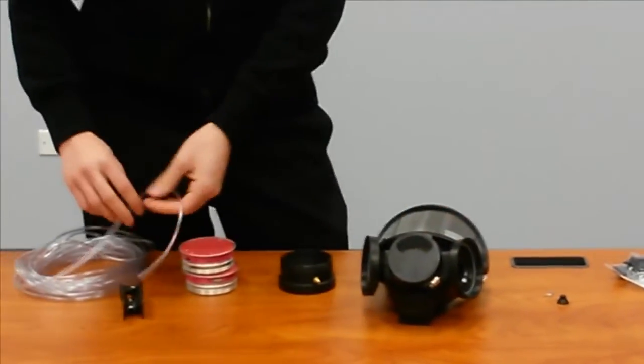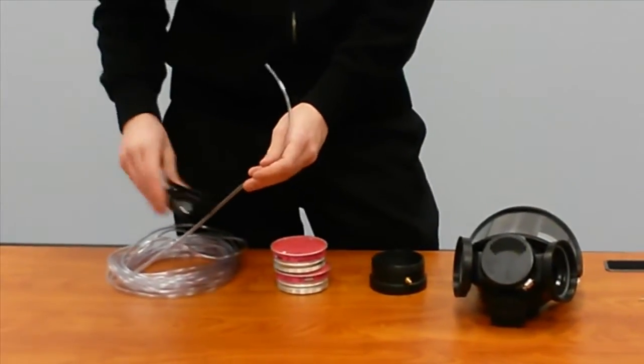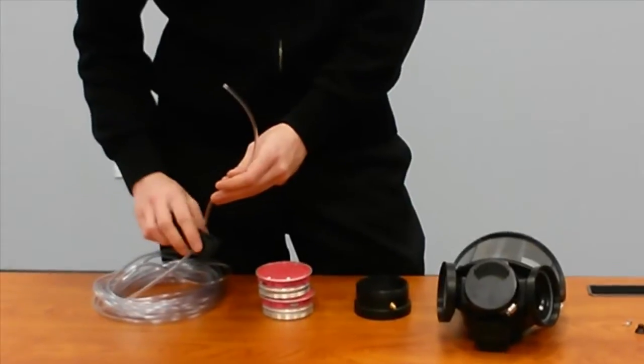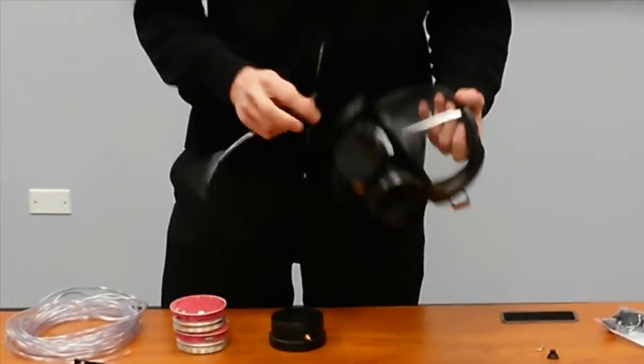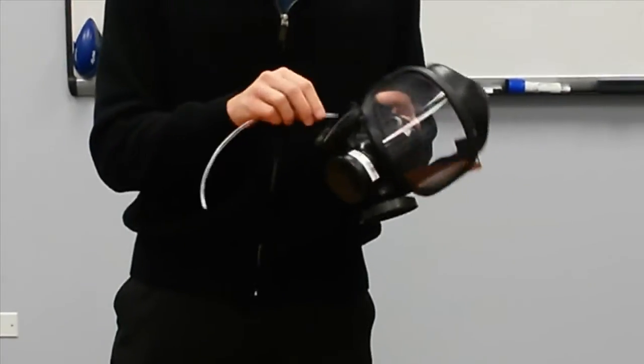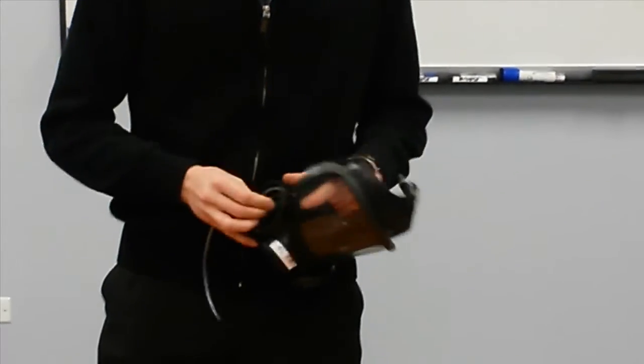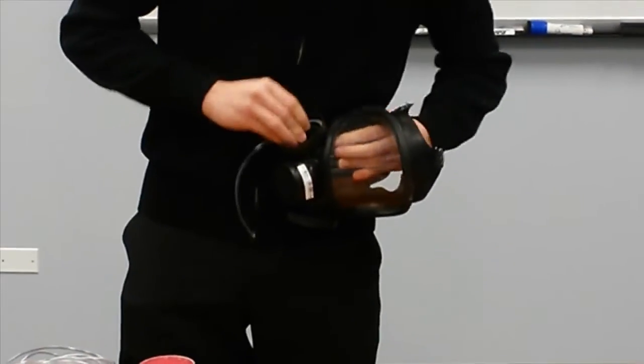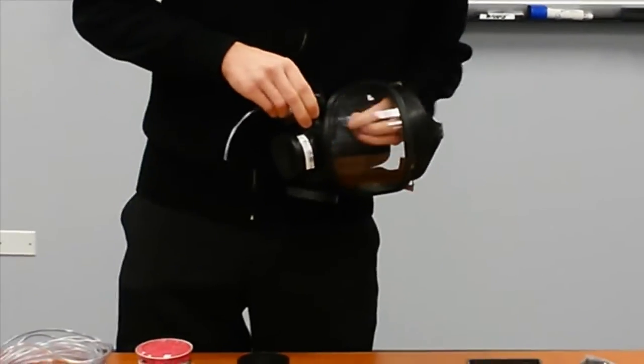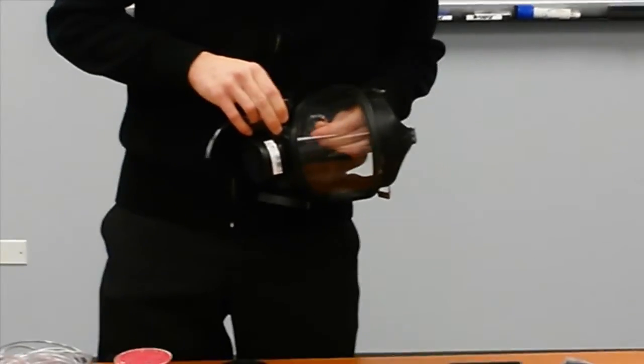You're going to want to cut a piece that's roughly six to eight inches in length. I cut mine a little bit longer just to make it easier to work with. We're going to run this through where the canister will attach to the respirator, and that's going to go up into the mask and through the valve.